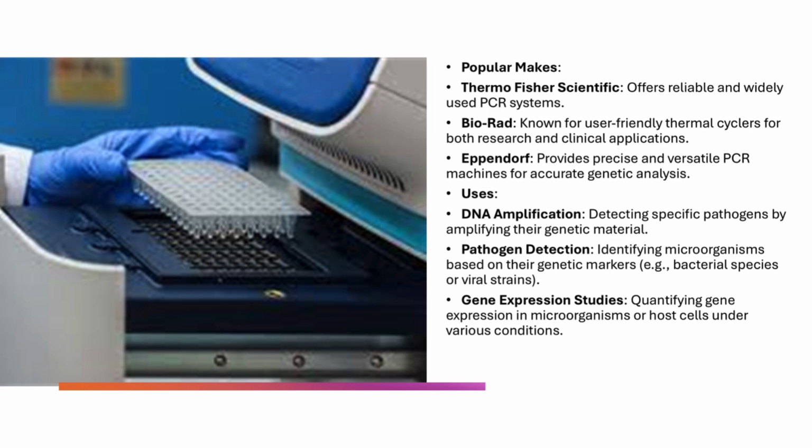Pathogen detection. PCR is particularly valuable for detecting microorganisms based on their unique genetic markers, such as bacterial species or viral strains. This allows for accurate pathogen identification, even when only trace amounts of DNA are present.